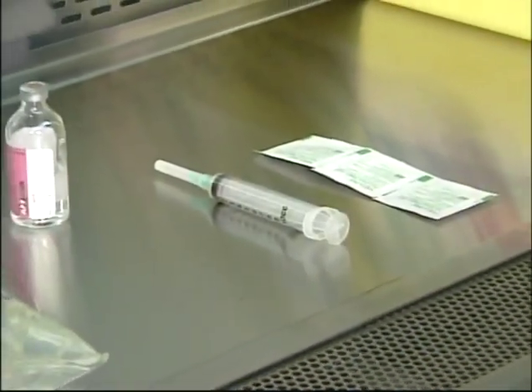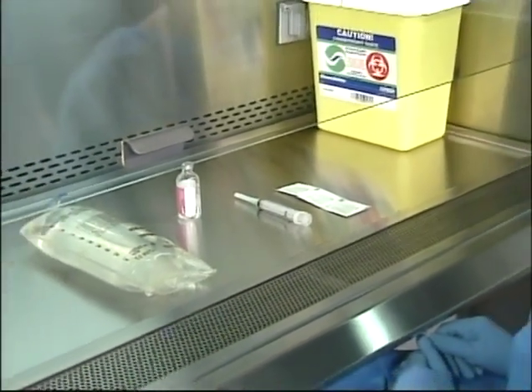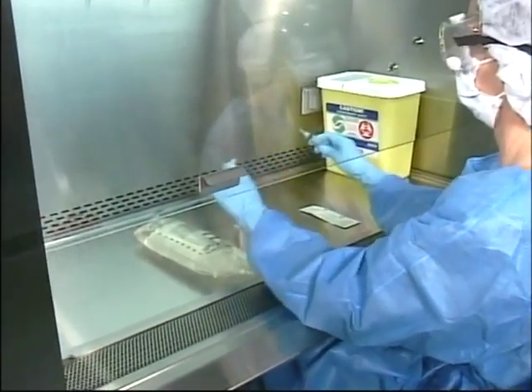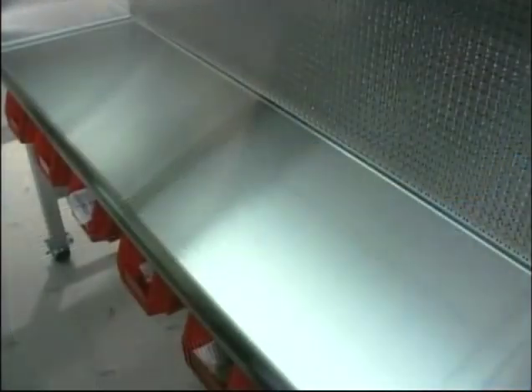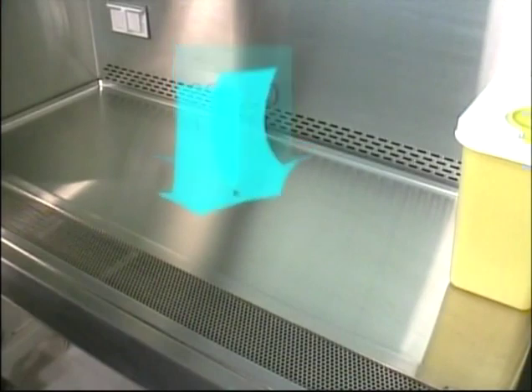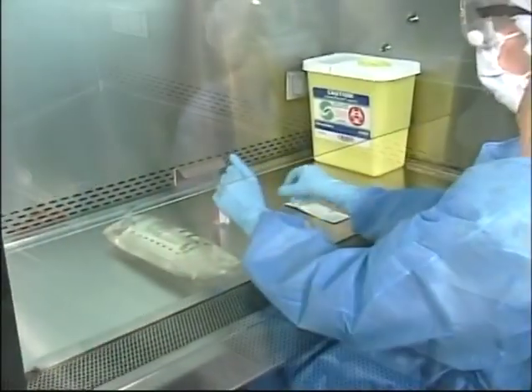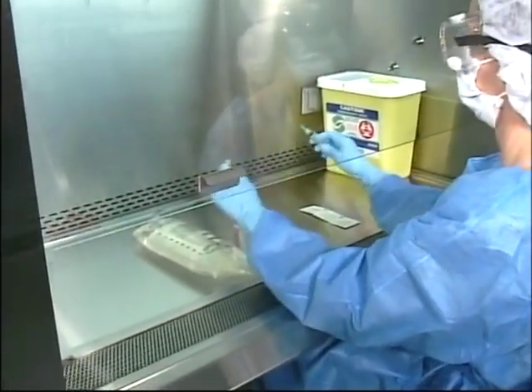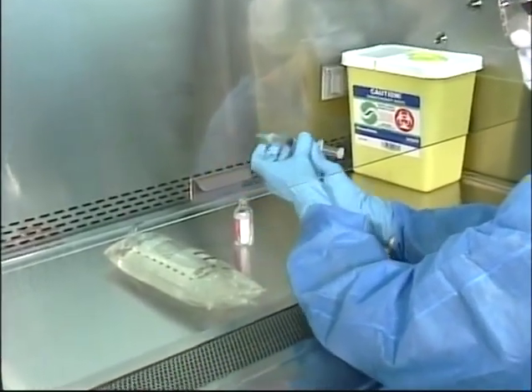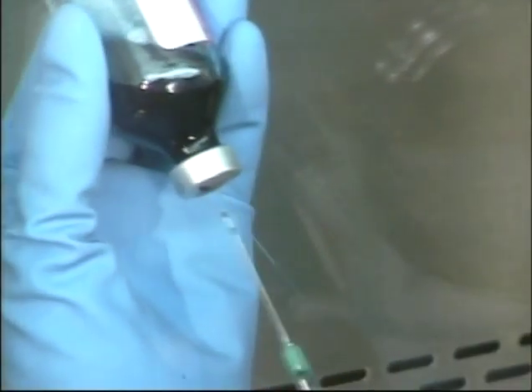The operator's arms extending into the cabinet create a disruption of the protective air stream. To minimize this disruption, hands should be inserted and removed in a slow, perpendicular motion, and rapid and erratic movements avoided. As with the LFCB, the airflow within the BSC is relatively slow and easily disrupted. Of special concern is air venting under pressure from vials, needles, and syringes. This air is heavily contaminated and is moving under much greater pressure and speed than the protective air curtain, and may easily penetrate the air curtain and contaminate the operator and the environment.